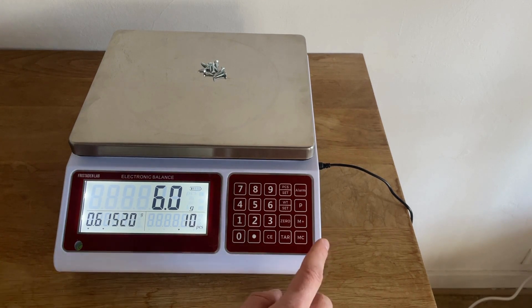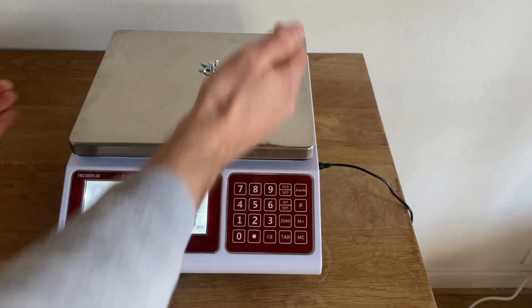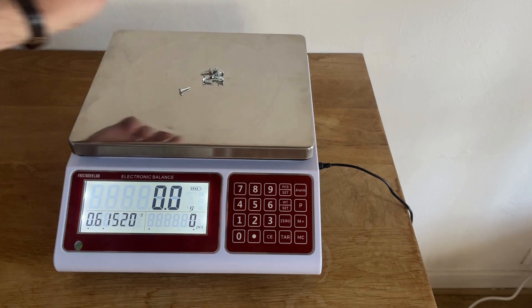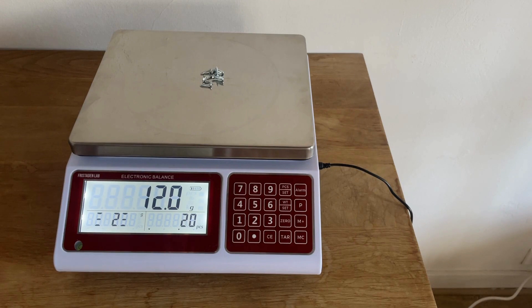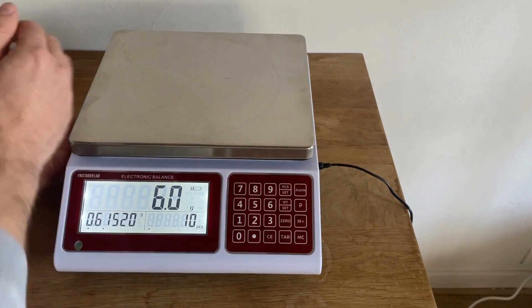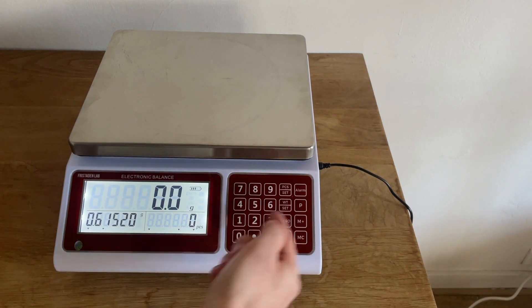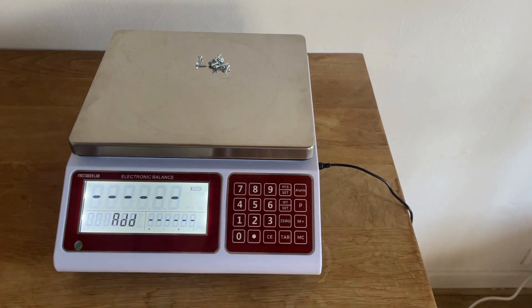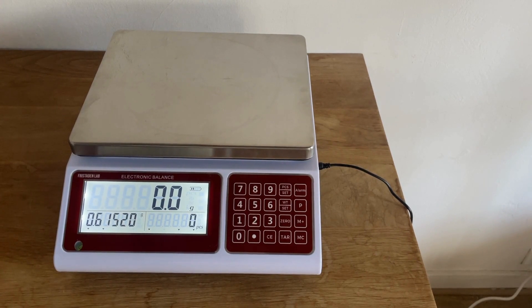If you have larger quantities, you can count above 30 kilograms using the accumulation function. Press M+ to add to the total. Take your sample off, place the next batch on, press M+ again — for example, 12 grams and 20 units accumulated. You can repeat this to reach 30 pieces or more, which is really useful for large inventory that exceeds the scale's capacity.